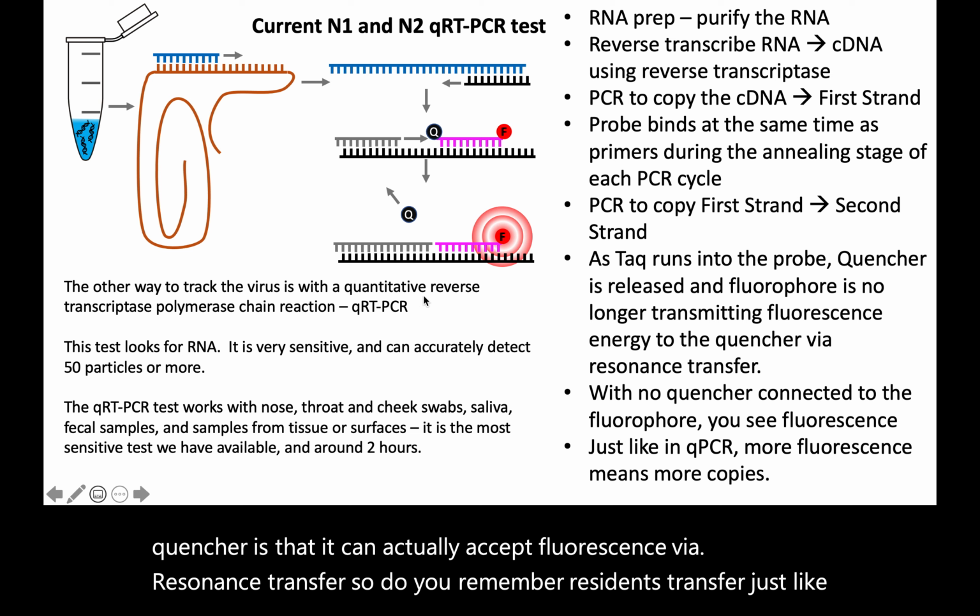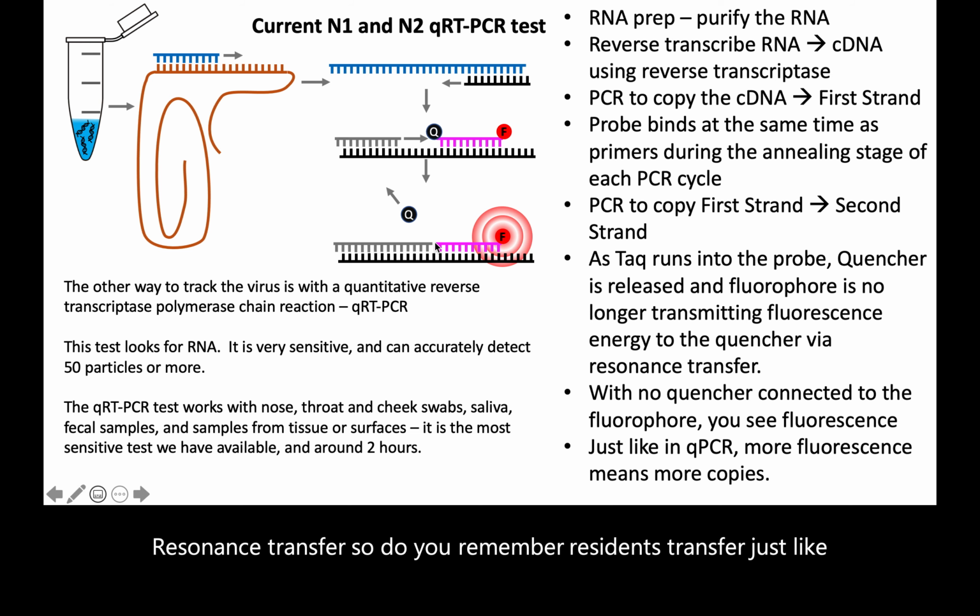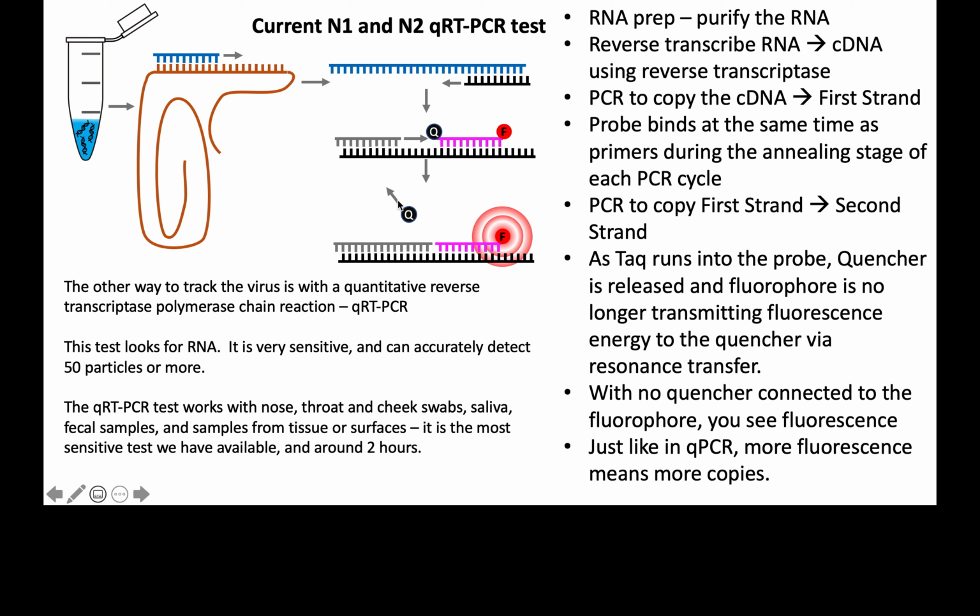And we can do it right down a little chain, like this little DNA probe, from one end to the other. And as long as the quencher and fluorophore are attached to each other, the quencher will quench all the fluorescence from the fluorophore. So you can hit the fluorophore with your nice blue laser, and you're not going to see green light because your quencher is going to eat it all up, or eat most of it up.